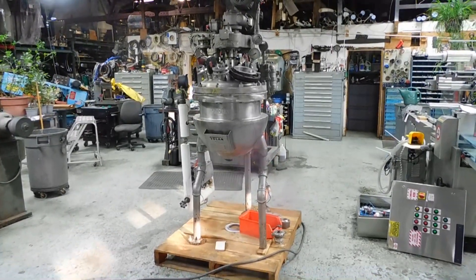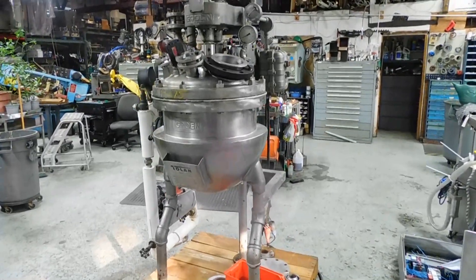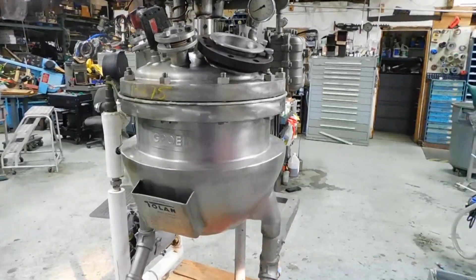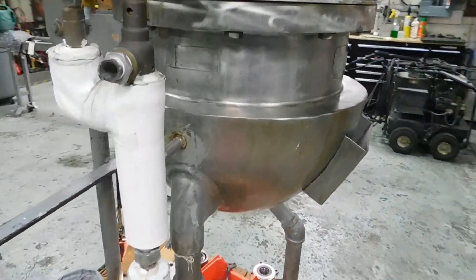Hi everybody, welcome again to Champion Trading. What we're showing you today is a Groen 20-gallon stainless steel reactor. It's in 316 stainless. The reactor is rated for full vacuum, as well as fully jacketed body.